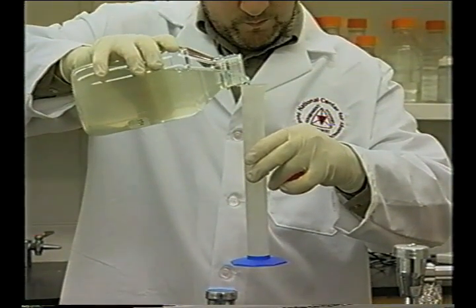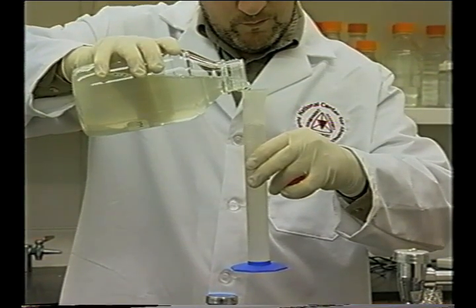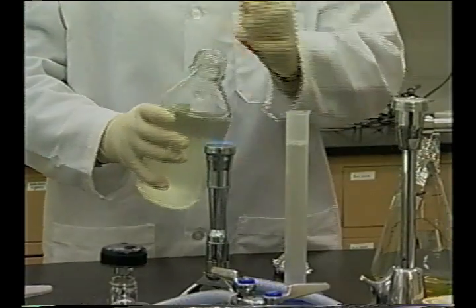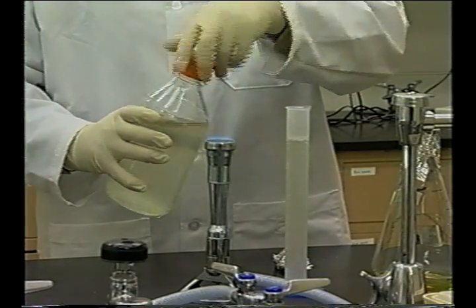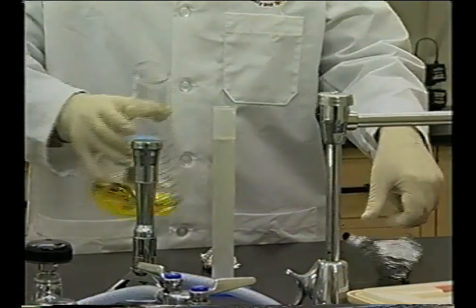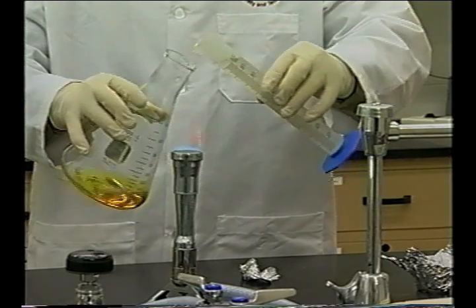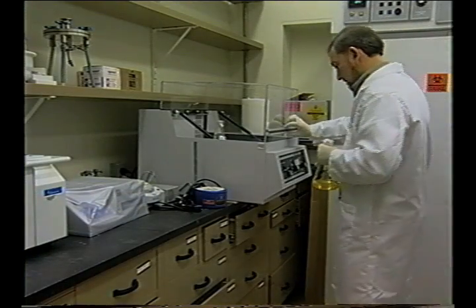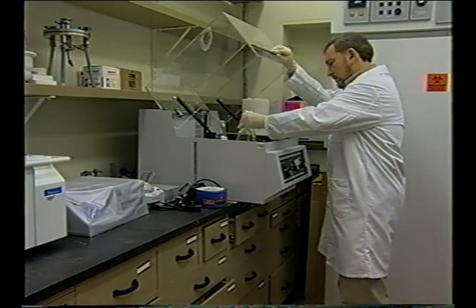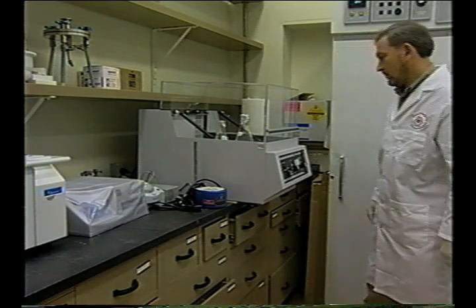Such a laboratory should be physically separated from the sprouting facility to prevent cross-contamination of the sprouts from test materials. Conducting these tests requires the use of cultures of pathogenic bacteria, which could pose a hazard both to the workers and the consumers if not done properly. The laboratory should be staffed by personnel with training and experience in analytical microbiology techniques and handling of pathogens.